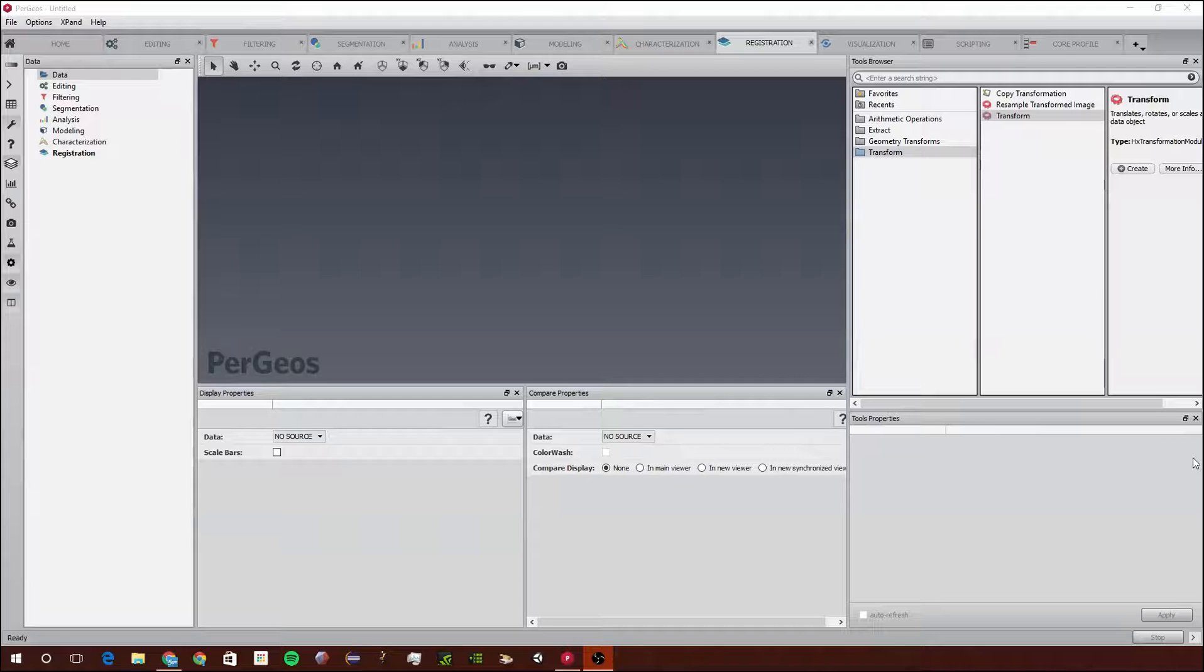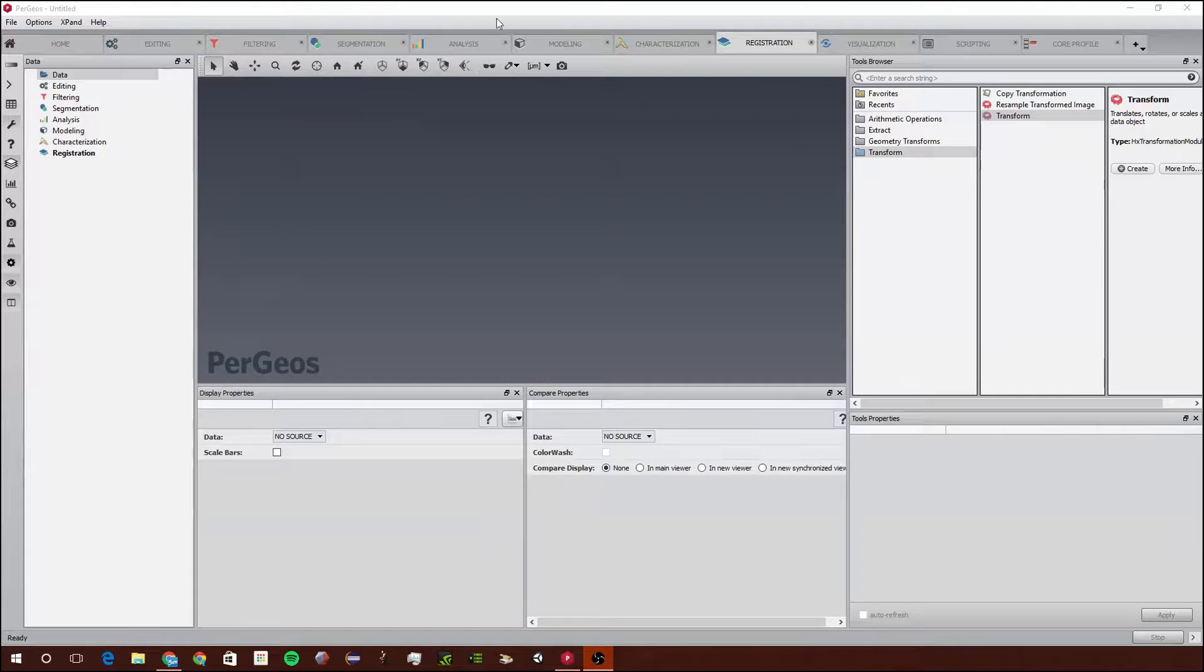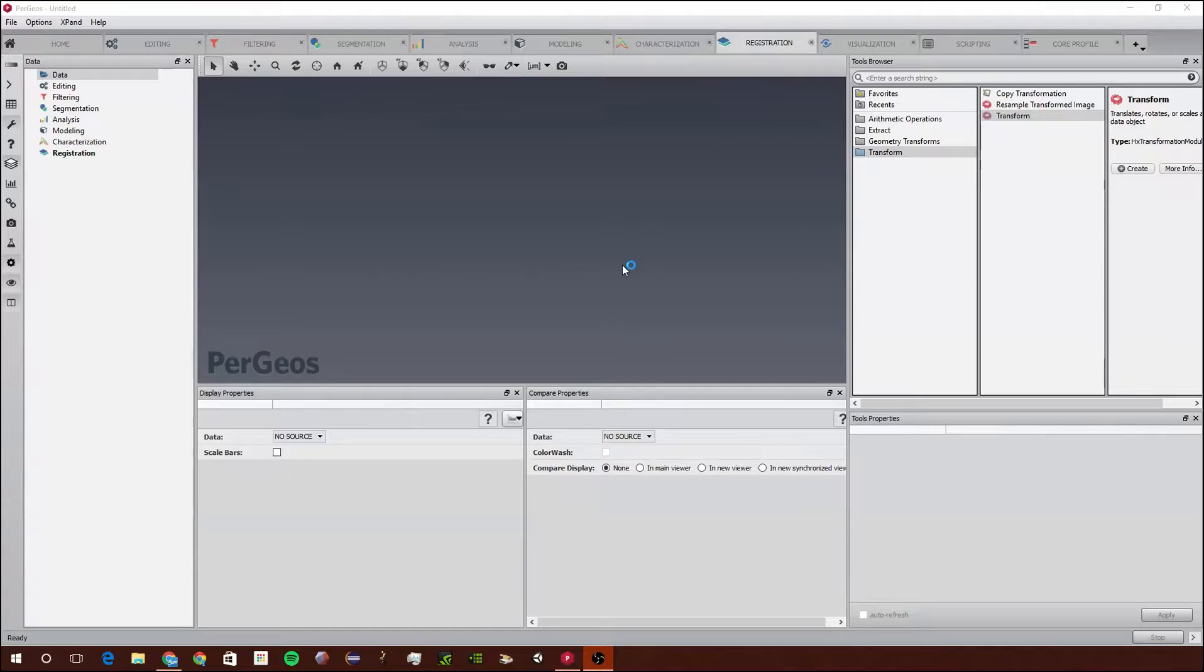Hi, this is Sam and this is another Pergeos tutorial. In this tutorial we will cover the registration workspace and how to register images.